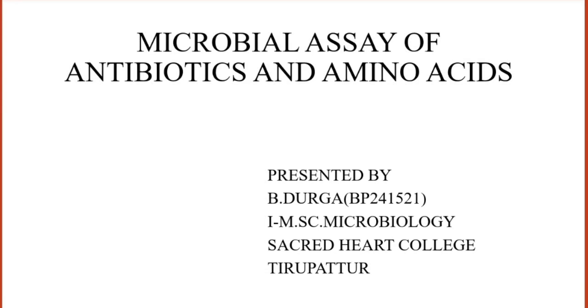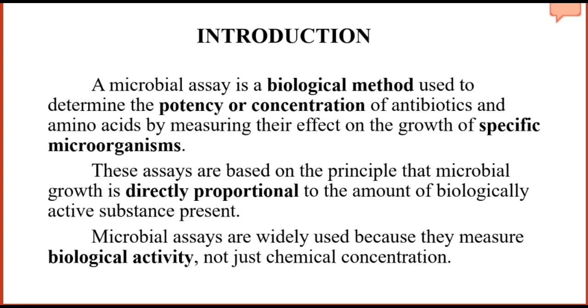Today we are going to see about microbial assay of antibiotics and amino acid. Introduction. A microbial assay is a biological method used to determine the potency or concentration of antibiotics and amino acid by measuring their effect on the growth of specific microorganism.